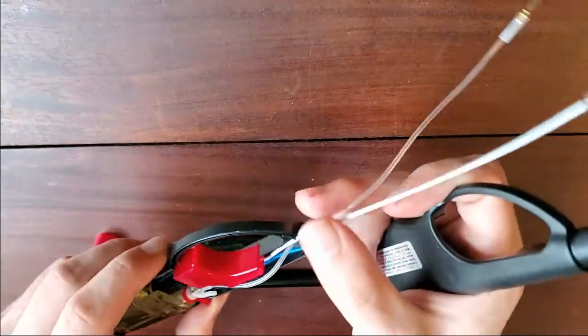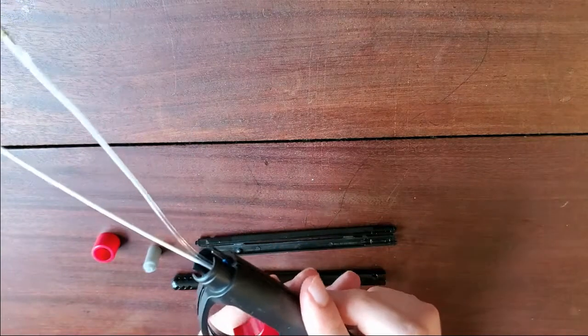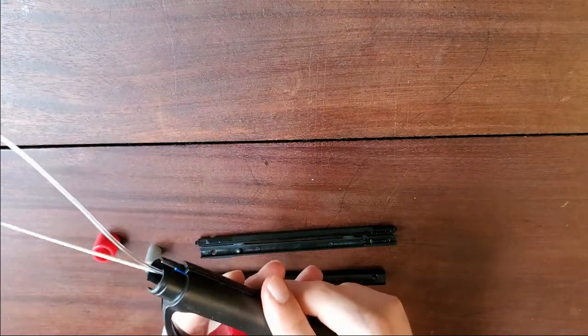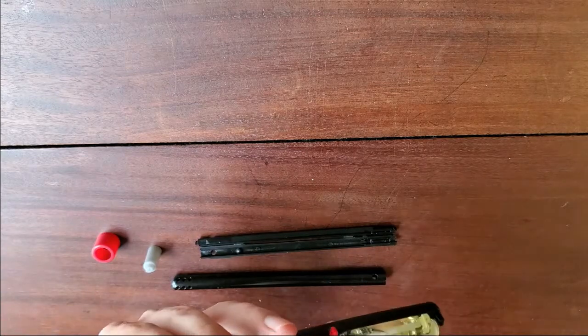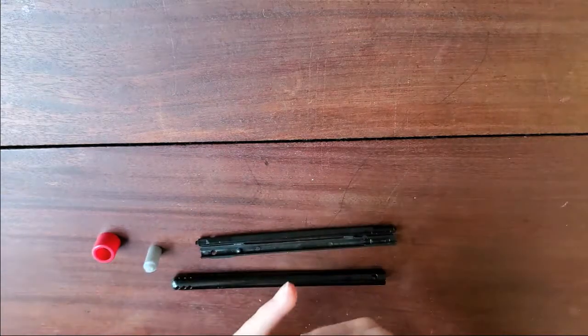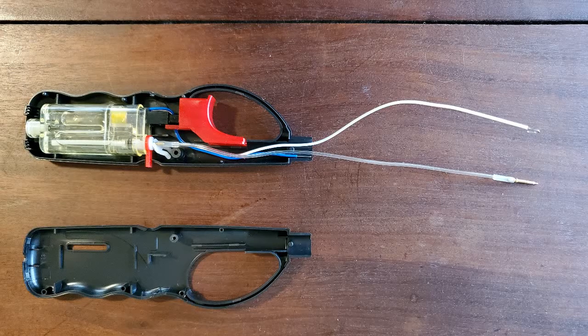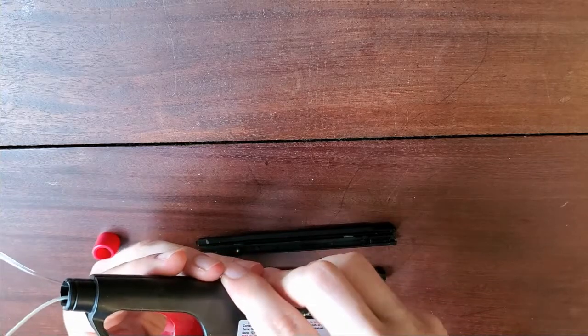If you were just to use this, it would work. I'll just slide the pieces together. There we go. So this is one wire — the other one is just at the bottom there. But you can actually clean this up even a little bit more.